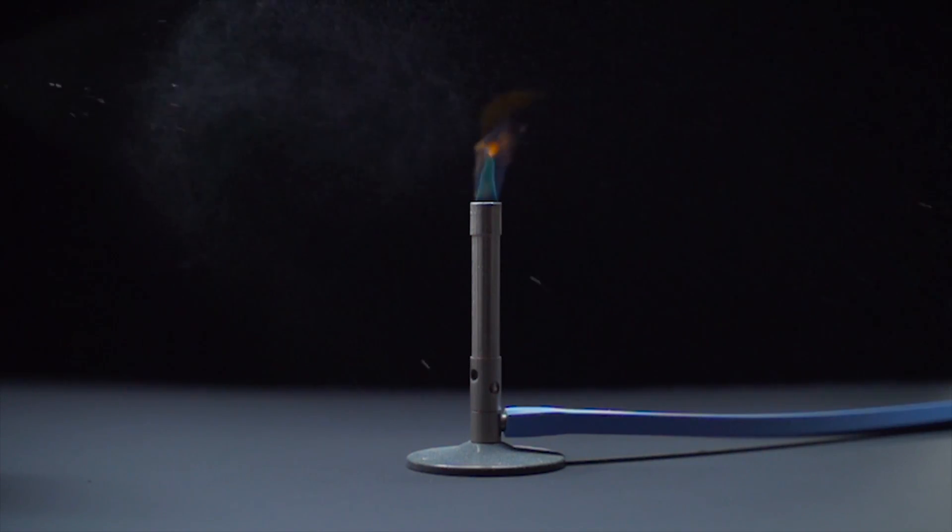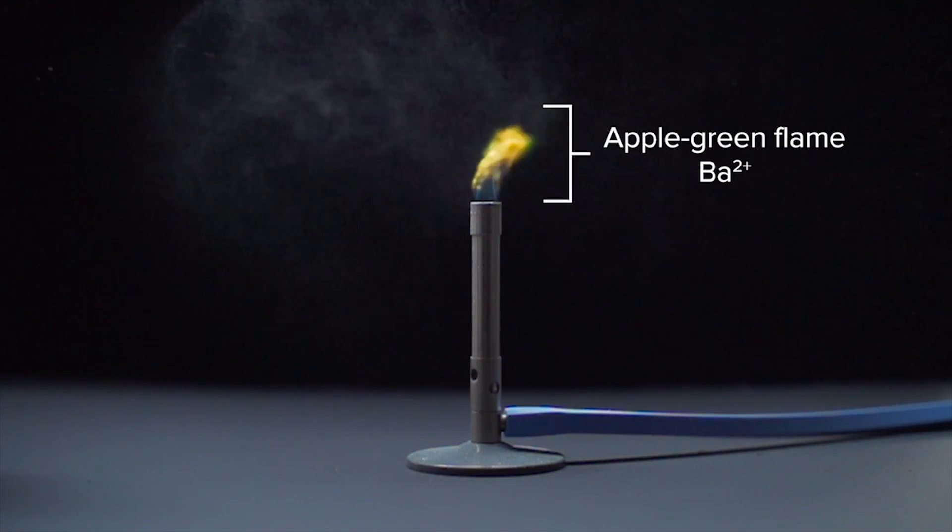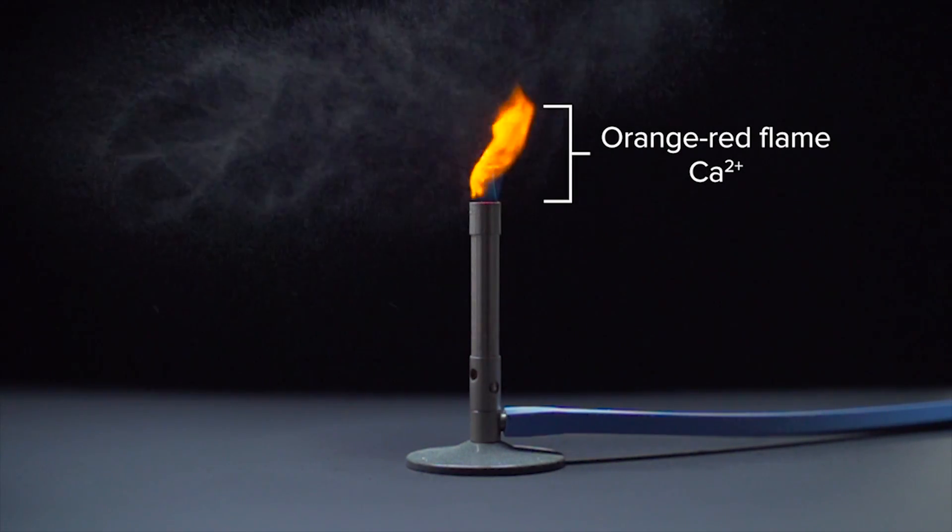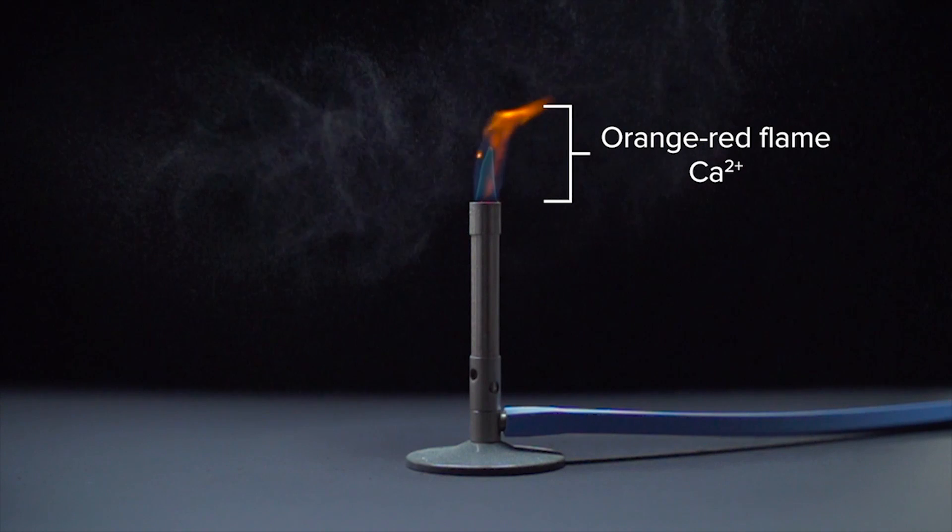If the flame is apple green then it contains barium ions. And if it is orange-red when the sample is sprayed it contains calcium ions.